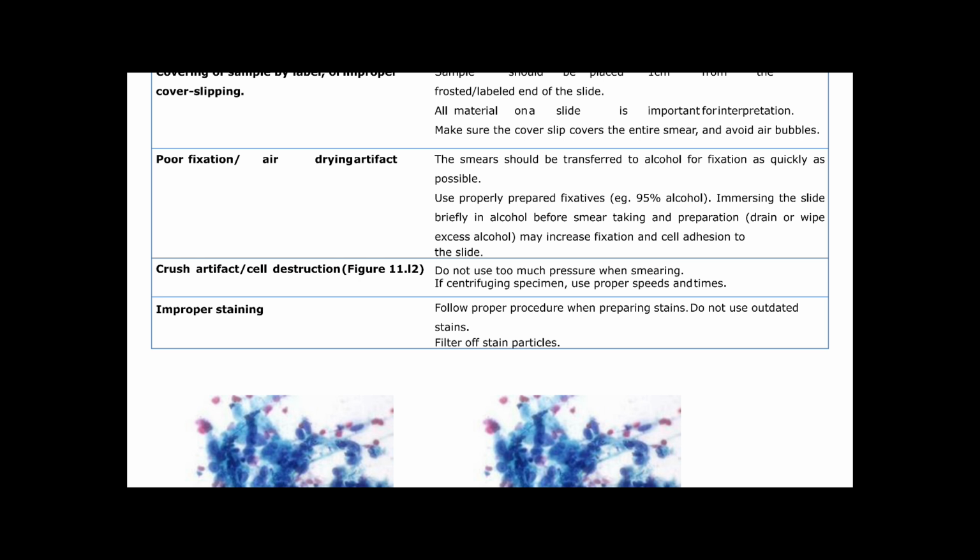So next one is improper staining. This is another problem. How to solve or prevent this? Follow the proper procedure when preparing stains. Do not use outdated stains and filter off stain particles. Sometimes if the stain contains stain particles, it interferes with our interpretation of the cell morphology.